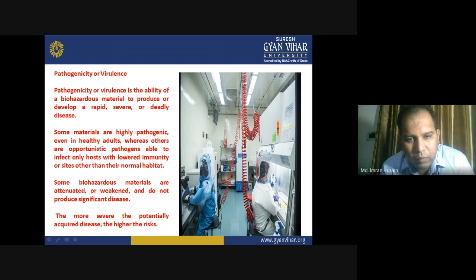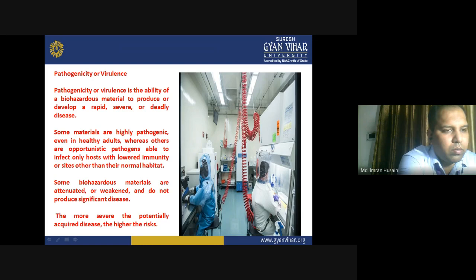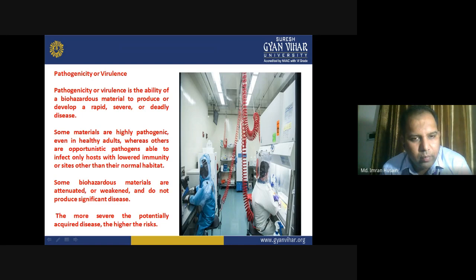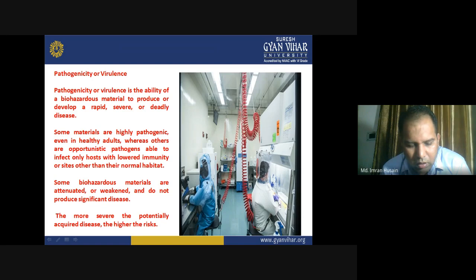The more severe the potentially acquired disease, the higher the risk. For example, consider the COVID outbreak in India — you can easily determine the potential risk of acquired disease and the higher risk. What is the percentage of pathogenic infection, how severe is the infection, and what is the rate of mortality or fatality?